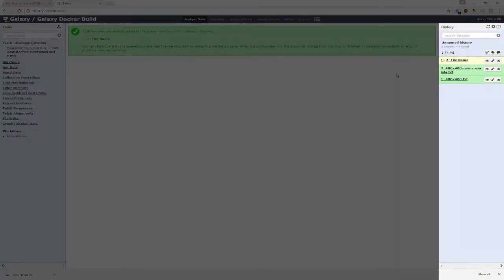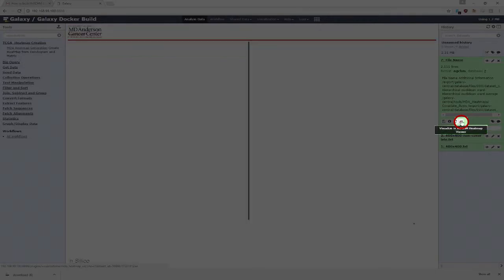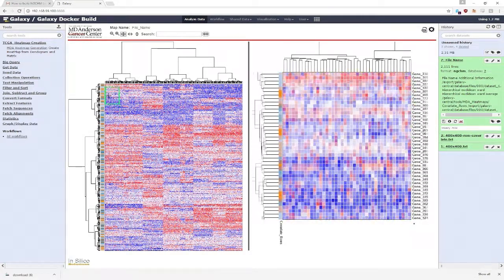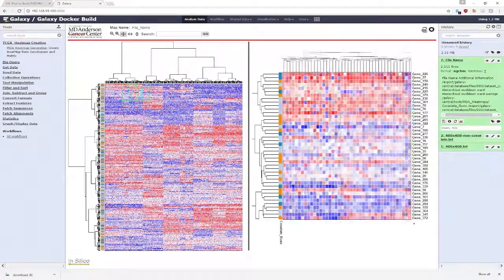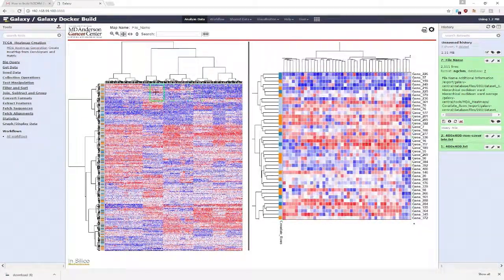Once the heat map generation step turns green, it is ready to be viewed. Click on your heat map and from that drop-down, select the bar graph item that says Visualize NG-CHM Heat Map. In the center section, you now have a dynamic interactive heat map of your data to explore. You can select portions of the heat map to examine in detail, pan, zoom, and search. Please see our NG-CHM Heat Map Navigation Basics video to see the many dynamic capabilities of the NG-CHM Heat Map Viewer.